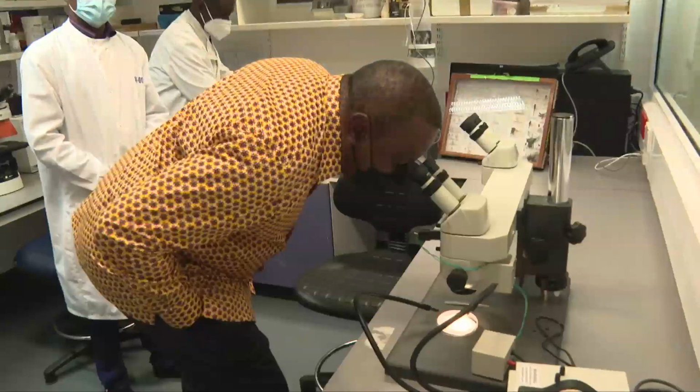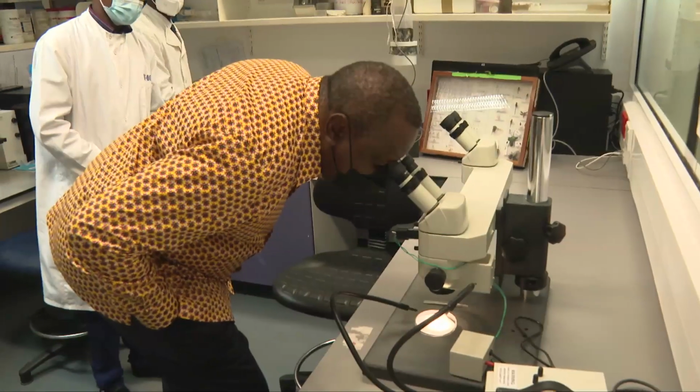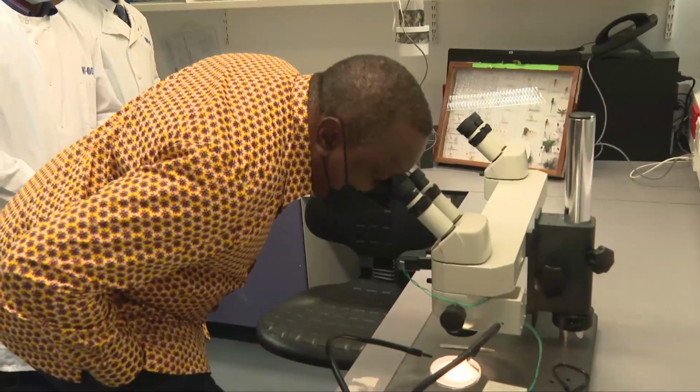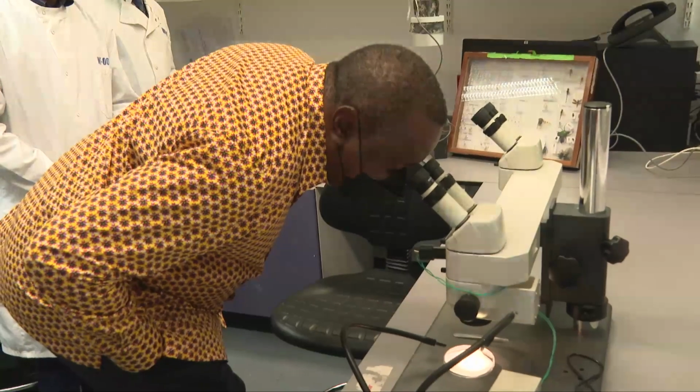Yeah, these are the mosquitoes. So here you can actually dissect them. And actually you can identify it. You can see there is a male, which is full of glands. And the other one is a female, which is actually the one which transmits malaria.